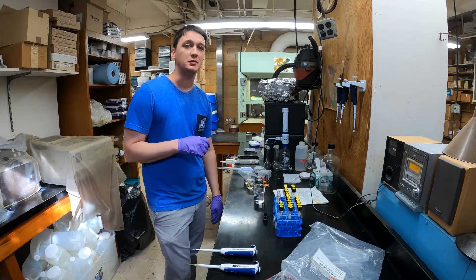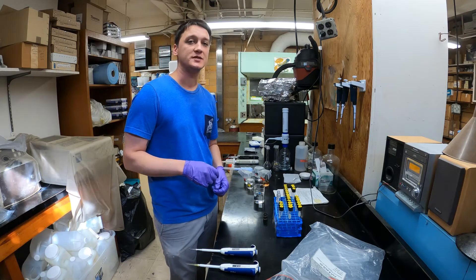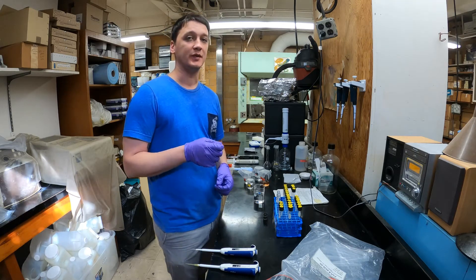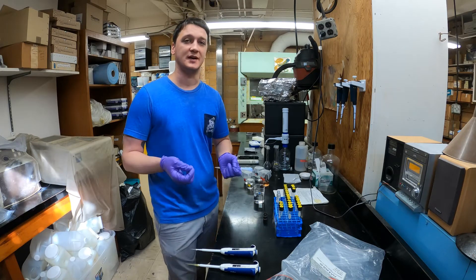It's a method called the endophenol blue method. It's based on the reaction of ammonium in our water samples — in an alkaline environment, the ammonium will react with phenol, producing a blue color, and it also needs to be in the presence of an oxidizing agent.